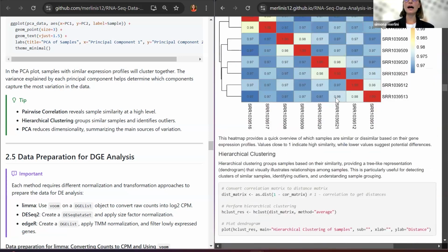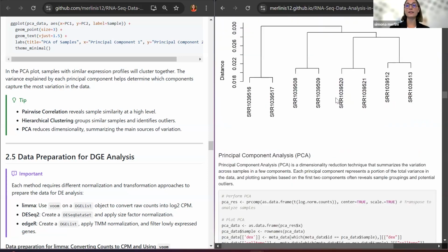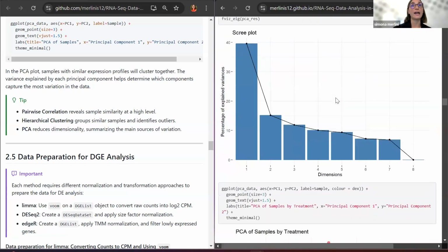Yeah, so the metadata are not related to the output of the RNA-Seq. So usually what happens, for example, if you are doing some experiment with mice, you have a table with all the information about your mice, such as month, sex, and others that you are interested in, and then you have the gene read counts data apart. So yeah, they're always separated.